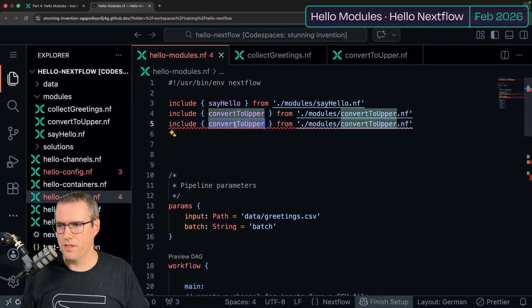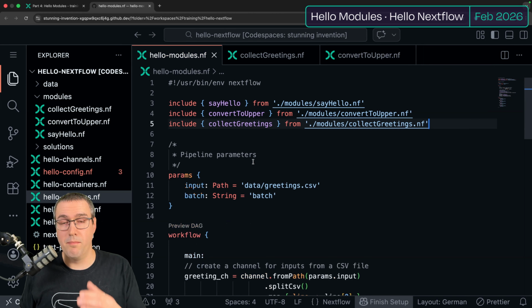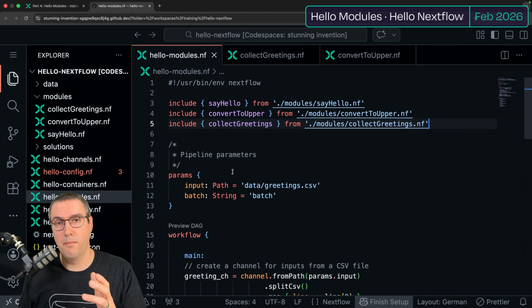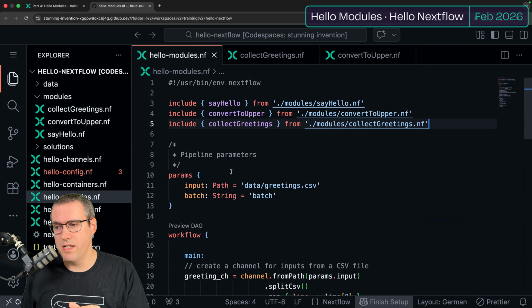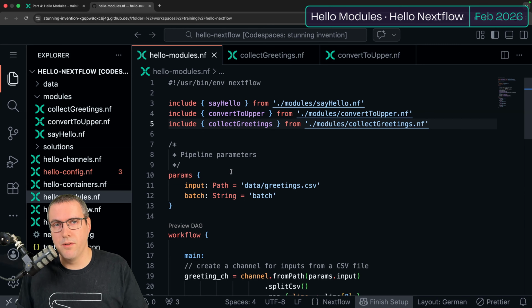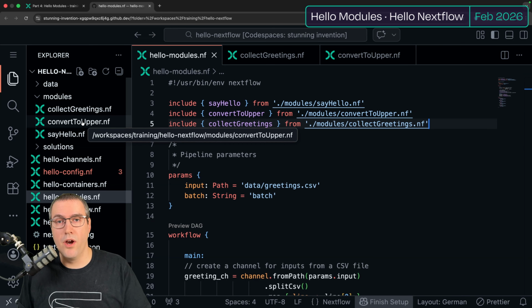Lots of cutting and copying and pasting. And now our main workflow script is suddenly looking much shorter, much more approachable and a lot easier to read. And you can kind of see how the project now starts to build up with our different files. We can dive into the detail in the places we want to, navigate our way around to find specific steps in the pipeline much more easily, and get an overview of what the pipeline is doing quickly.